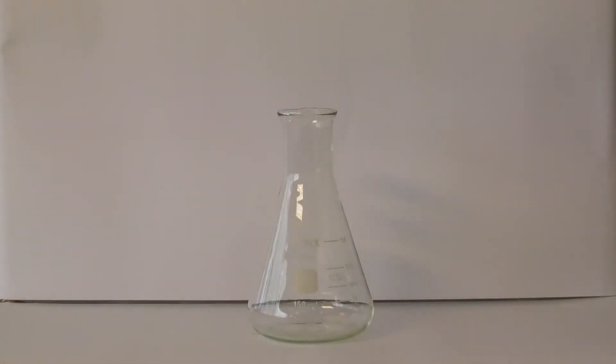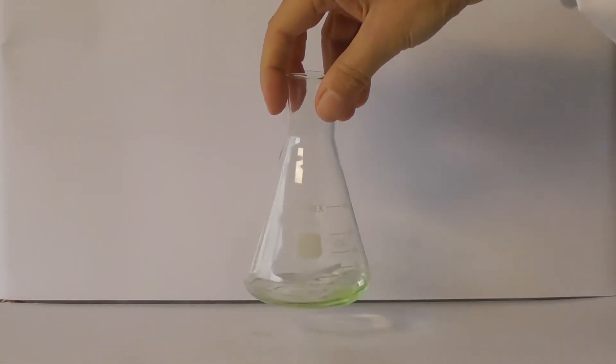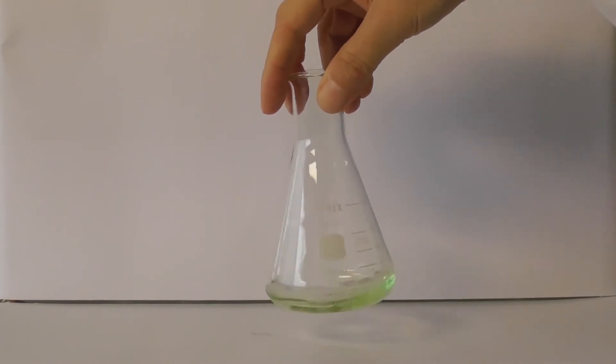This flask looks clean, but as we add our solution, residue left behind is dissolved into the solution, contaminating it. Here, that residue is colored, so it's easy to see. If it were colorless, as a lot of residues are, you won't know if your solution is contaminated until it's too late.